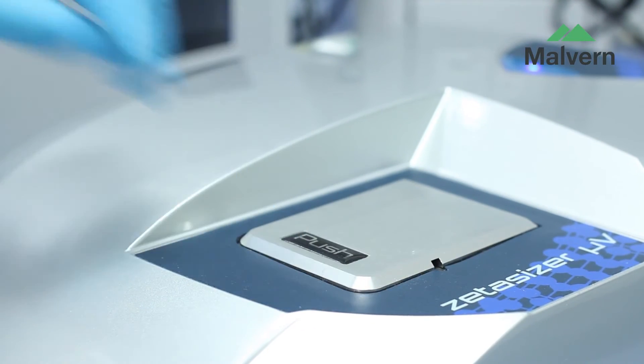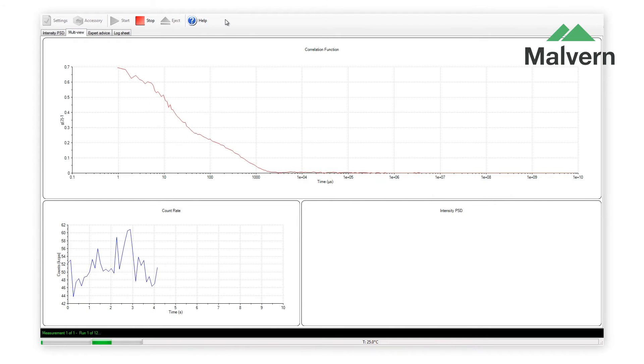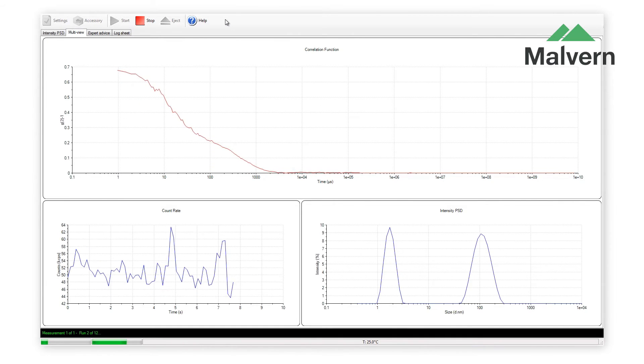If the aggregation needs to be explored in more detail, thermal trend measurements can be set up quickly and easily. The Zetasizer software reports the results clearly, offering quality advice and guidance to the user.